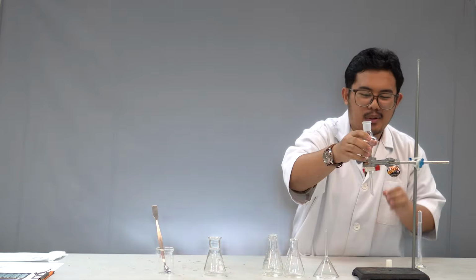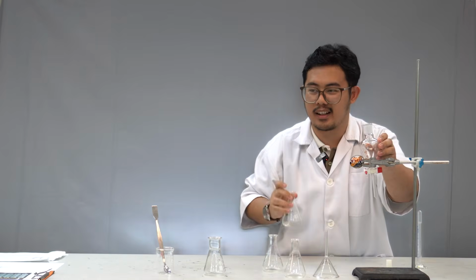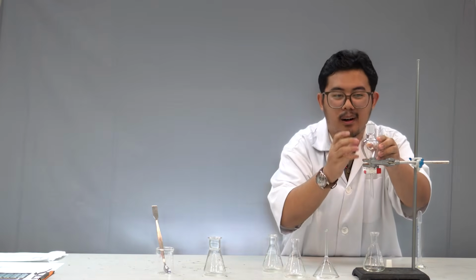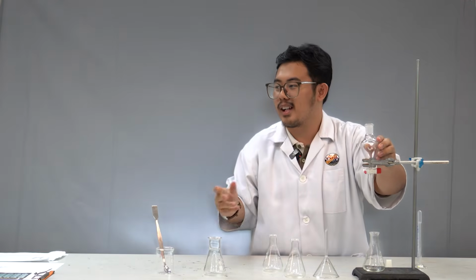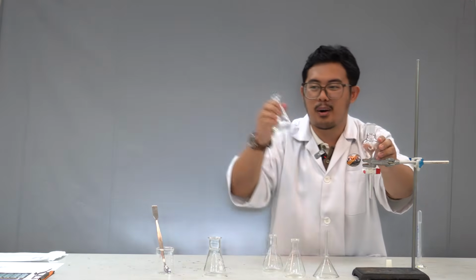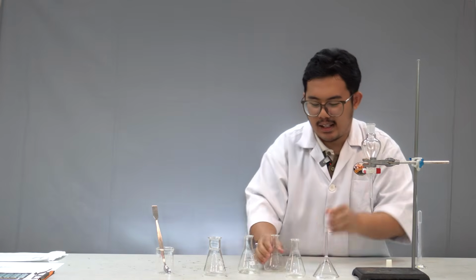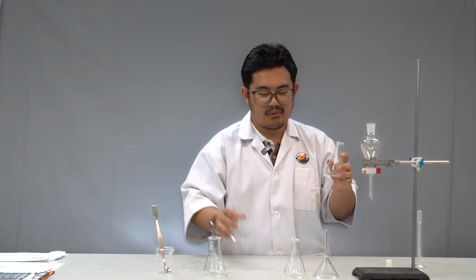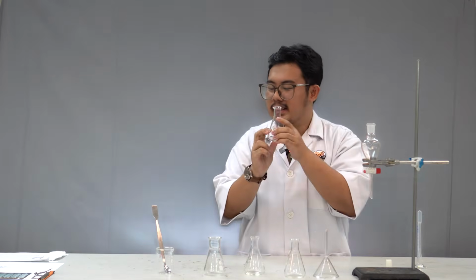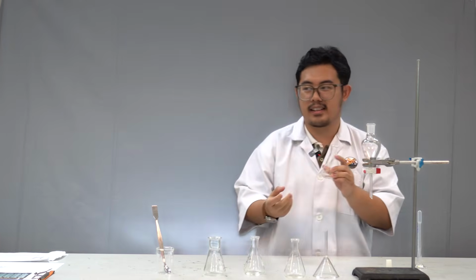So now we have only the acid. Now we take the acid conical flask, and then we pour out all the leftovers. What happens? This is pure acid. This is what we want. And we have 2 conical flasks with pure acid and a mixture. But this mixture, it has neutral, base, and still a little bit of acid.